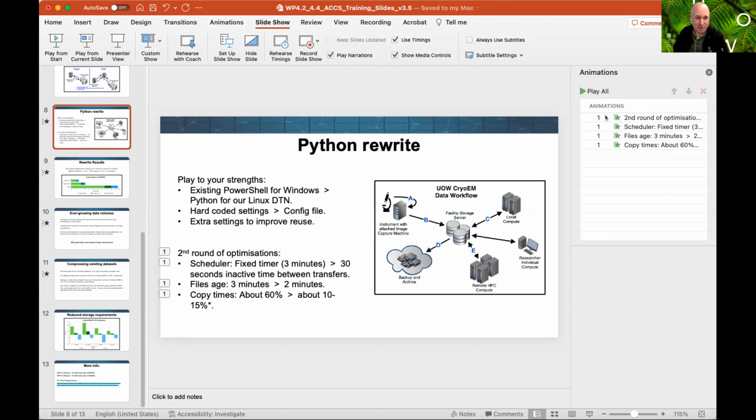We did a bunch of tests first, making sure that running things through CryoSPARC and RELION and stuff, just to make sure that there wasn't something going on with the data and its usefulness. If we were compressing it and all of a sudden it became junk data, then we have bad quality images. We have a predilection for imaging molecules which image really badly, so any lossiness out there could be a problem. But if you've tested it all, that's good.